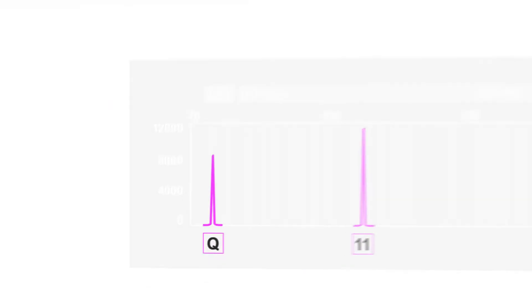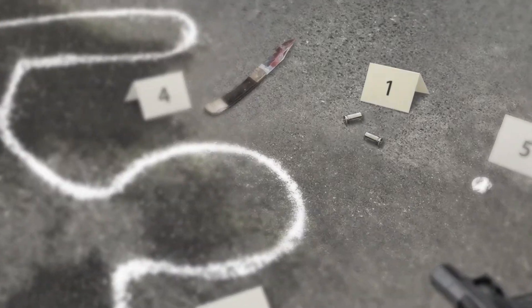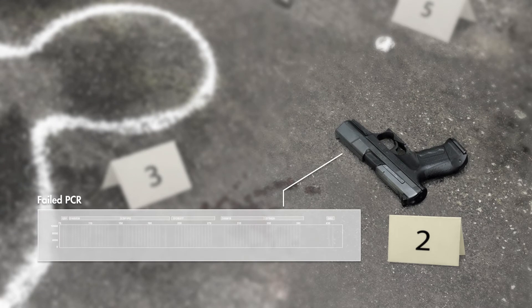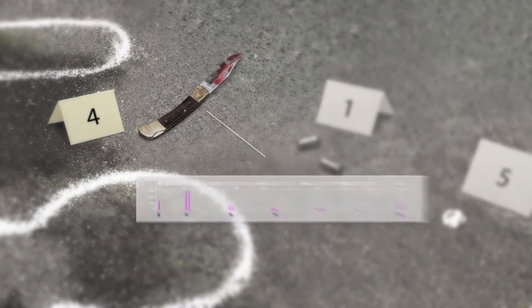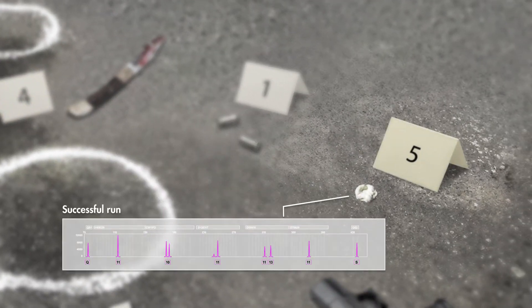Forensic crime scene investigation deals with various types of evidence and specific challenges that can stand in the way of closing cases. Some samples may give the DNA profiles you need, but others might give poor quality profiles or no results at all. Knowing why you had no result or an unexpectedly poor profile saves time and money because you avoid unsuccessful reruns. The investigator quality sensor acts as an internal STR performance control, lets you test every sample and see exactly what your results mean.